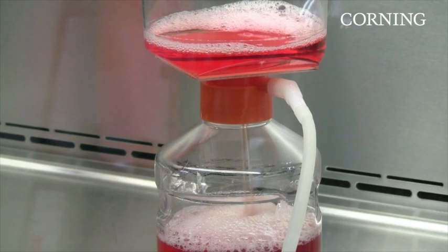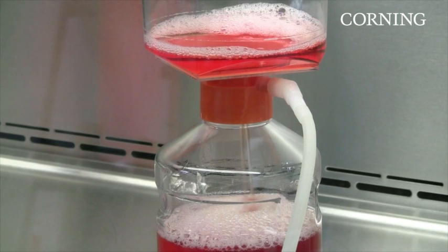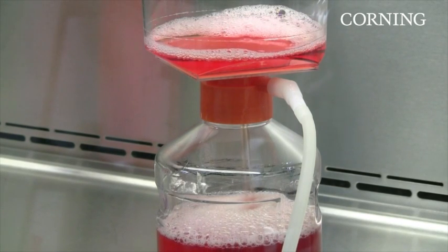The 0.22 micron PES membrane used in the Corning filtration system provides fast flow with low protein binding.